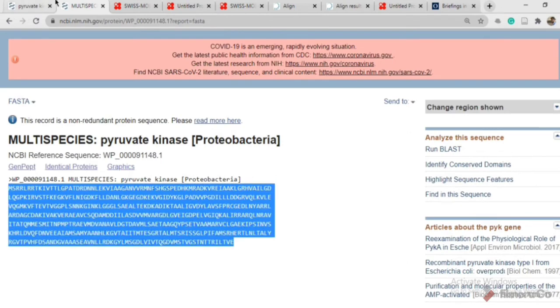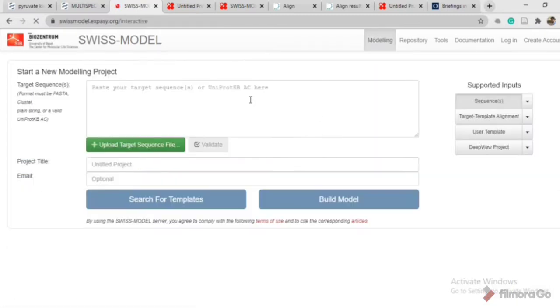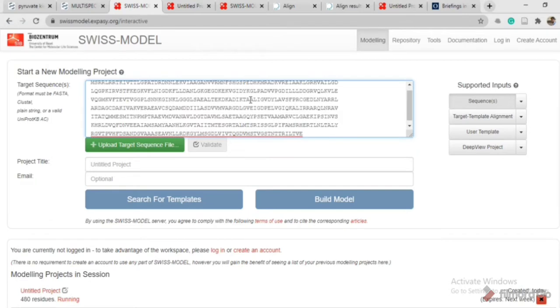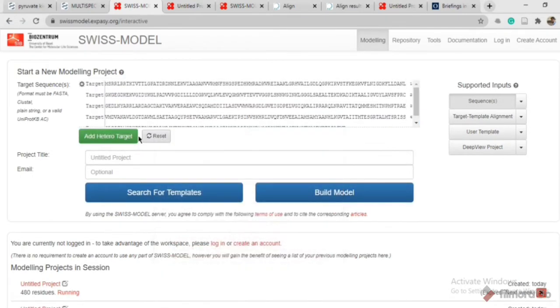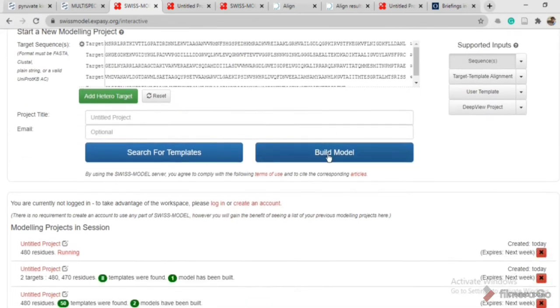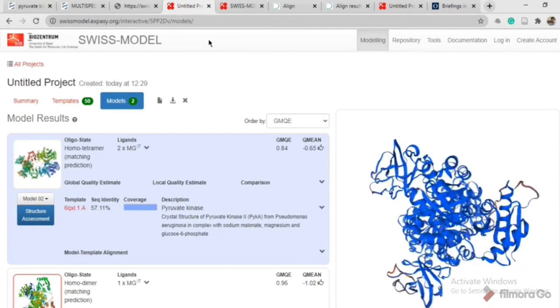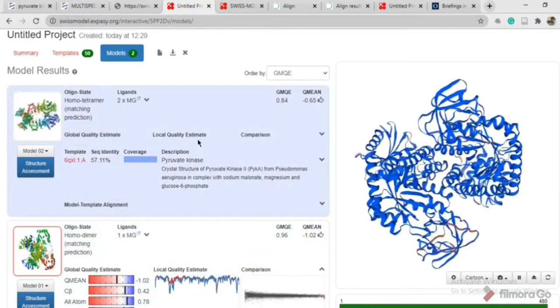Copy this protein sequence. In the next step open Swiss-Model and click on 'Start Modeling.' After clicking, you will get a field where you have to paste your FASTA sequence. Paste your sequence and it will get validated after a second, then click on 'Build Model.' When you click on Build Model you will get a new tab like this.